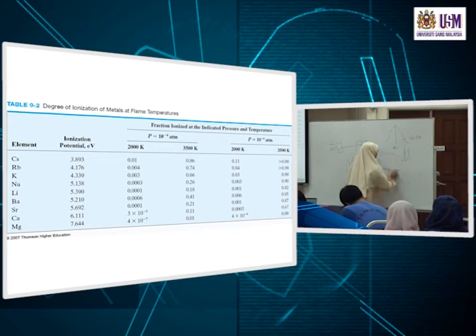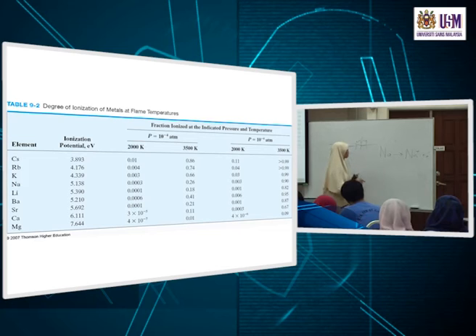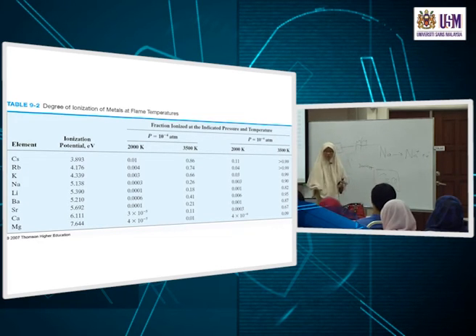And how does it work? I think you have explained it in the assignment that I gave back to you. For example, you are doing your analysis of sodium. Sodium has a low ionization potential, so you get ionization of sodium. One way is to add an ionization suppressant, lithium for example, or let's say cesium chloride. It's also an alkali metal. You add it at a high concentration, maybe 3000 ppm, to your standards and to your sample. So now in your system you have a lot of cesium.